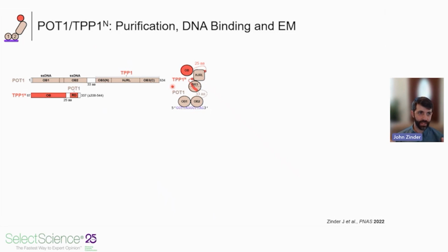And we also decided that what we were going to do is, rather than just go for it with the whole complex, we were going to break the complex down into simple functional units. So not just like a single Lego, maybe like a cluster of Legos in that case, that we knew would start to inform on its function. And when we put these simple functional units together, we could sort of build up in complexity and see what is the turning point where we can and can't interpret the data that we get from EM.